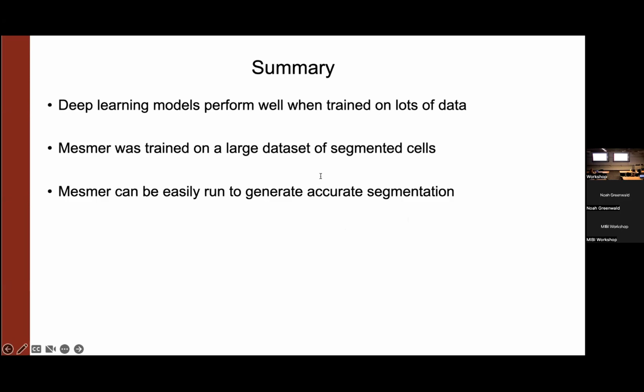Did you learn anything from the trained model about which markers work best? One thing that we saw from the model is that the best case scenario is you have a pure membrane marker. This is something that is only expressed on the membrane and isn't in the cytoplasm. The reason is that then it's much more obvious what the shape of that cell is.